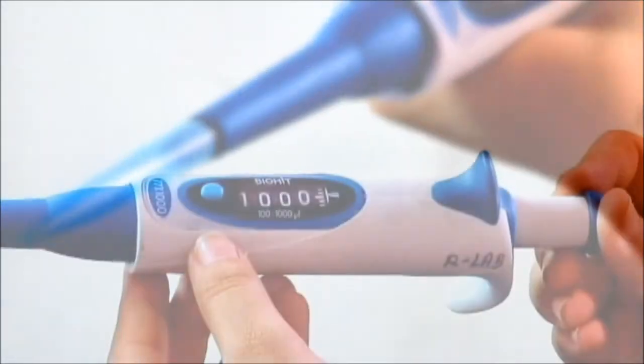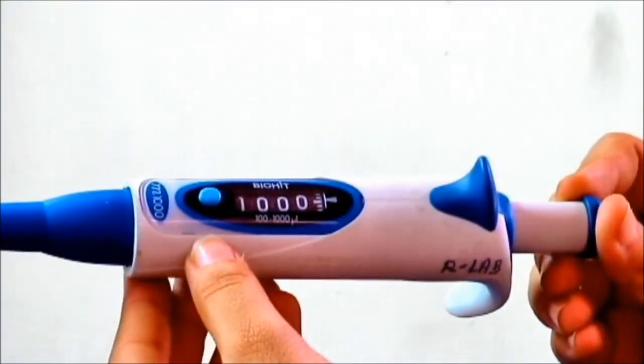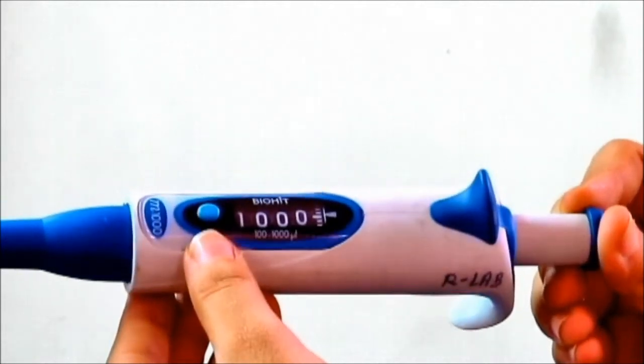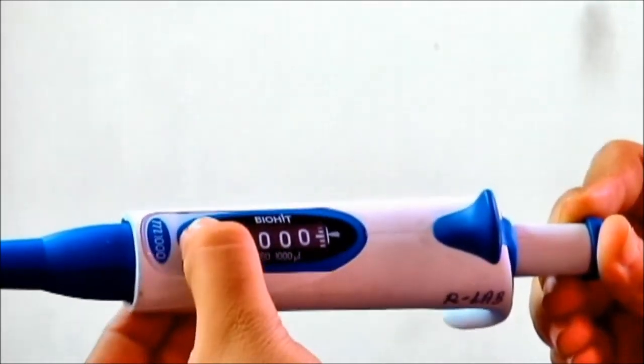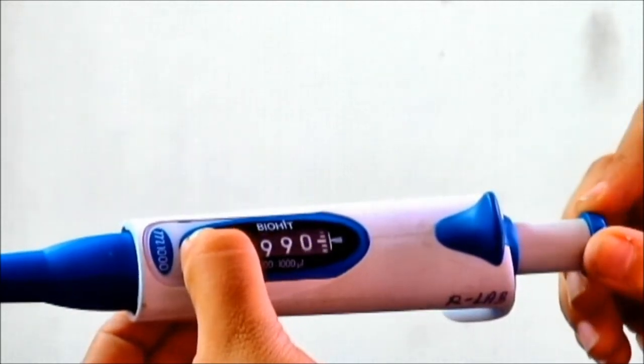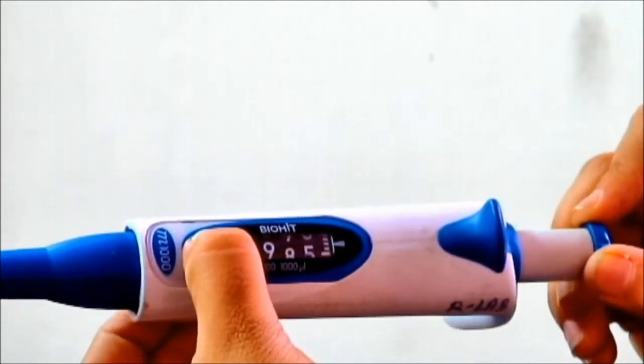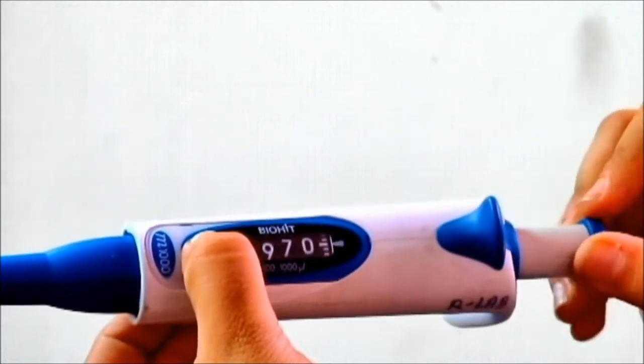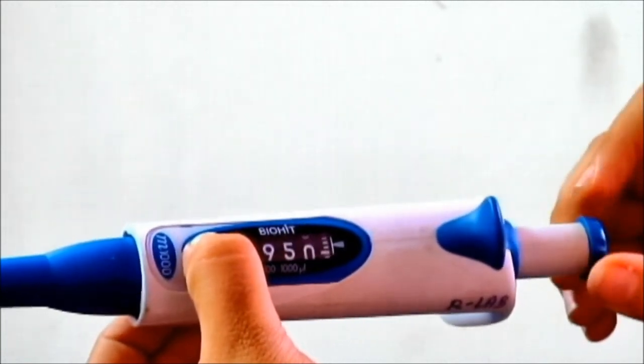In order to adjust the volume of liquid to be drawn, the button present near the digital volume indicator is pressed and simultaneously the volume adjustment knob is rotated to adjust the required volume and the button is then released.